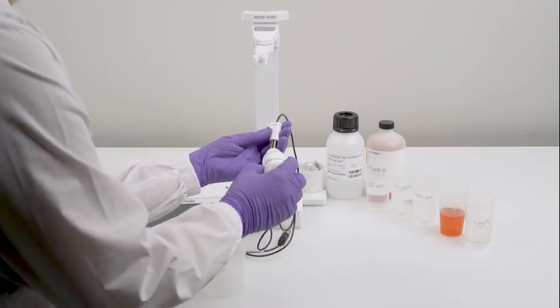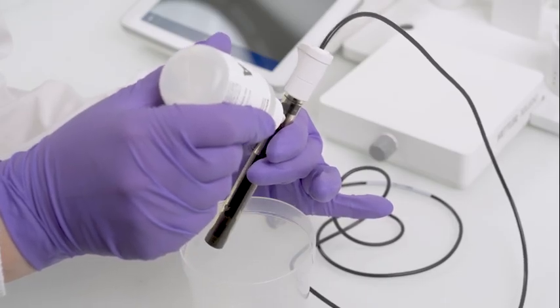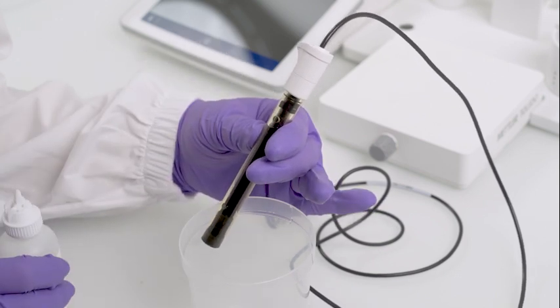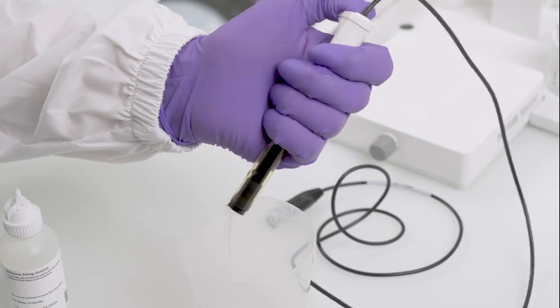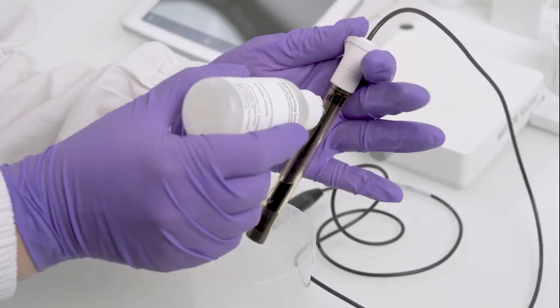Then fill the electrolyte up to the refilling hole and shortly press the click and clear button to ensure electrolyte outflow. If necessary, refill the electrolyte.